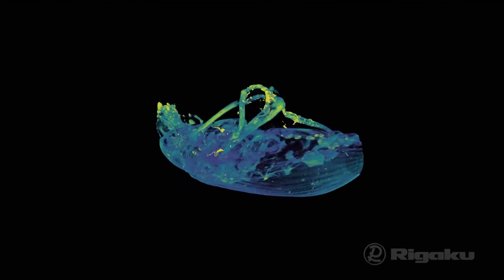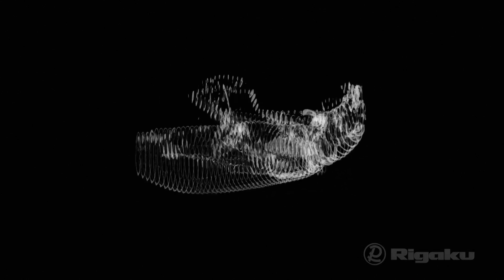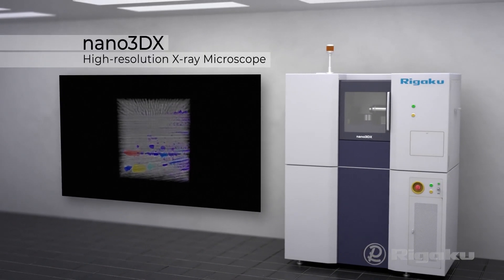X-ray CT non-destructively images various materials into thousands of microscopic slices with no time wasted on sample preparation. Rigaku's Nano 3DX takes it to another level.